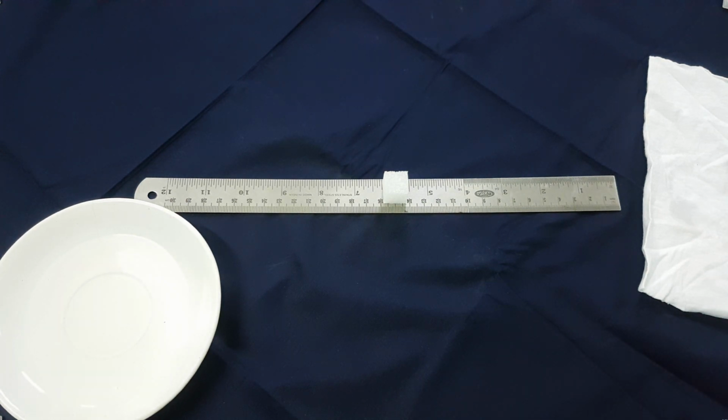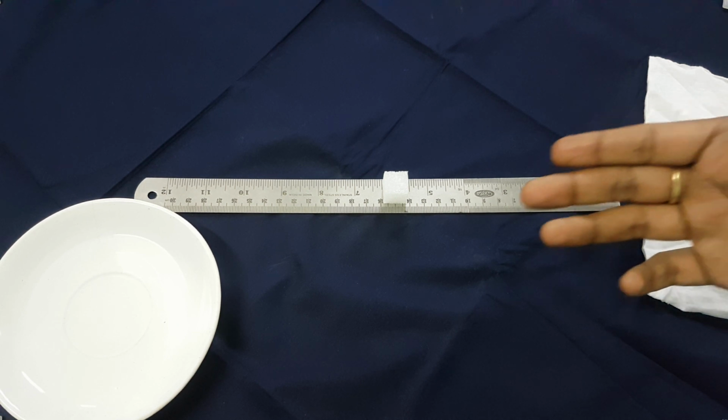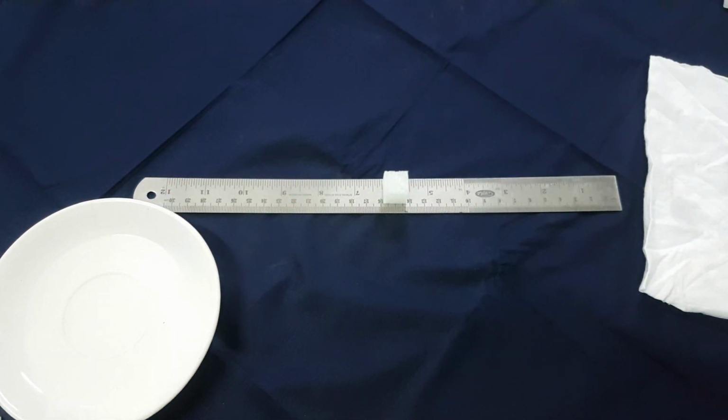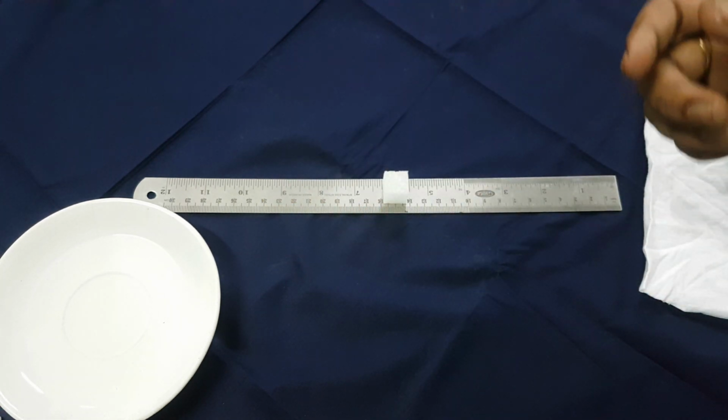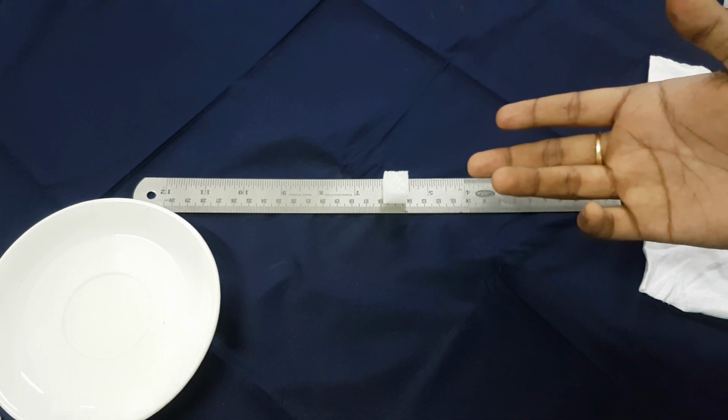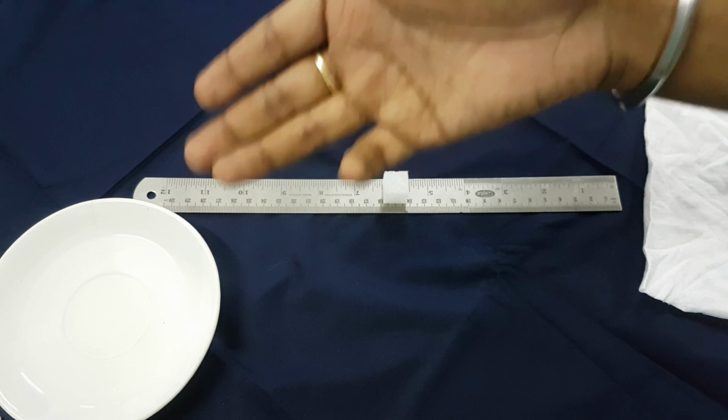Then we can measure the dimensions, and test whether silicone oil dissolves sugar cube. I am now 100% sure that silicone oil does not dissolve sugar cube, and hence we can say that sugar is not soluble in silicone oil.